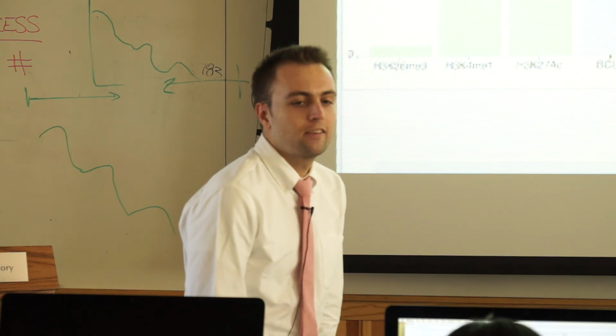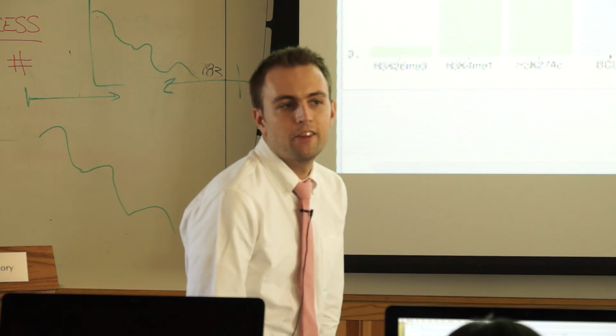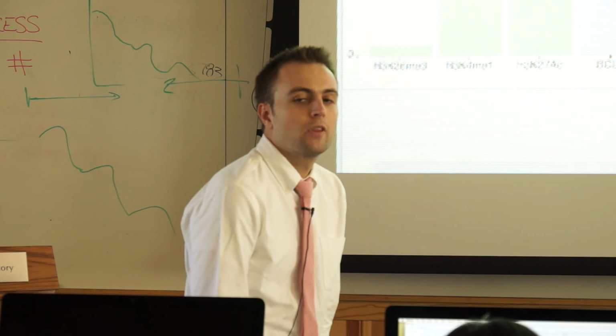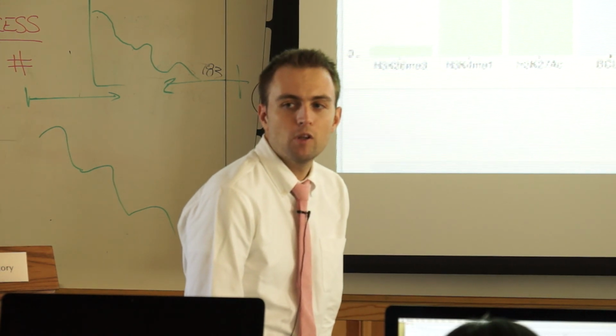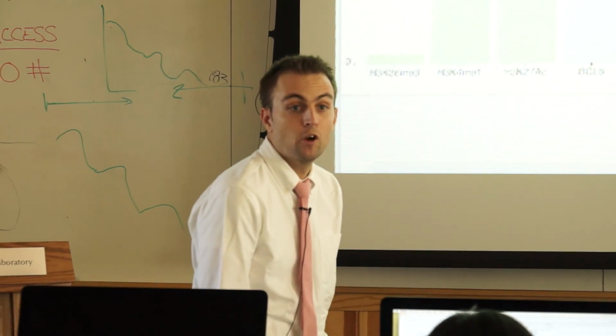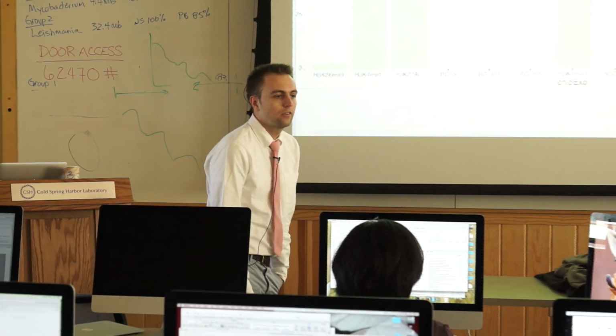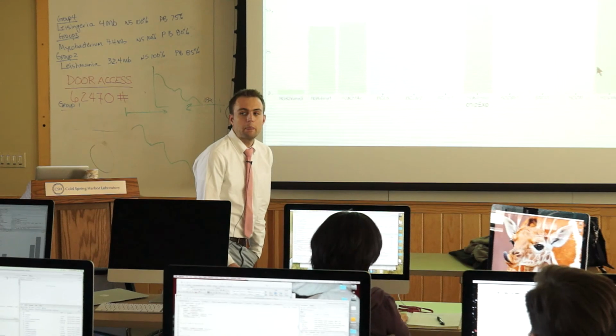So I thought maybe we'd take lunch now, and then there's some more stuff we could do after. You could also pull up the BAM file for this in IGV if you have it. If you don't have IGV, you can download it, or I can help you with all this stuff.